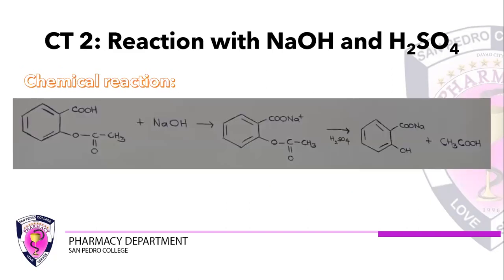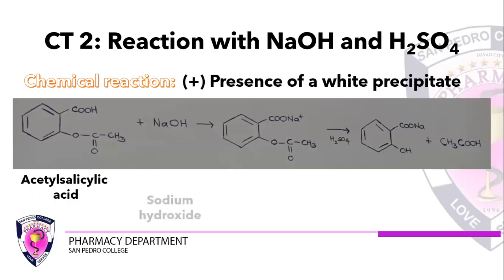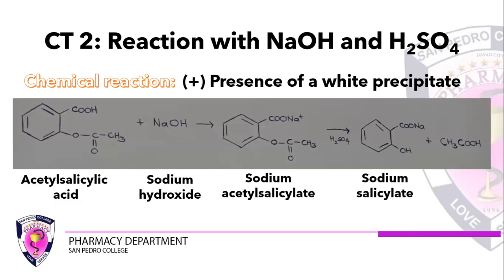All right, next reaction, reaction with sodium hydroxide and sulfuric acid. So we have the chemical reaction here, and the positive result, it's the presence of a white precipitate, which is true. So napakita doon sa video recording na merong cloudy precipitate.